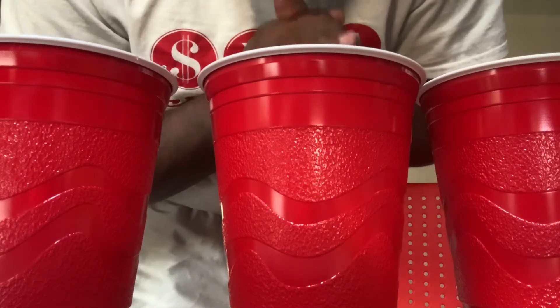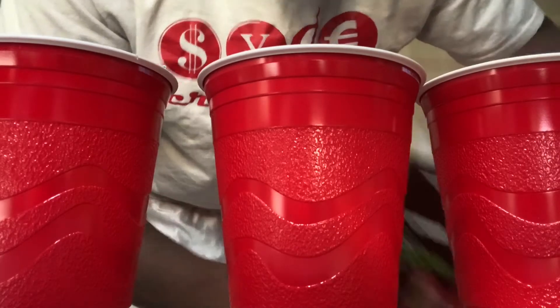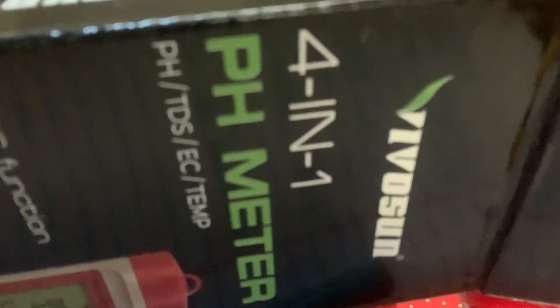Alrighty, so today guys, what we are going to do is calibrate the VivoSun PH pen 4-in-1 that they sent to me.